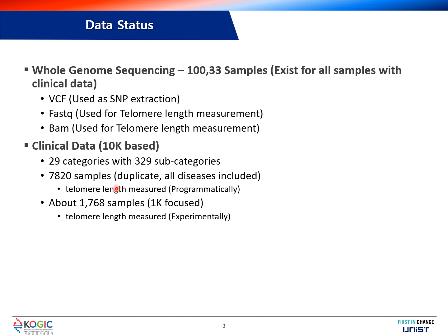As for 7,800 samples, they can be measured programmatically. And within the samples, we have 1,768 samples that have been experimentally measured in the lab.